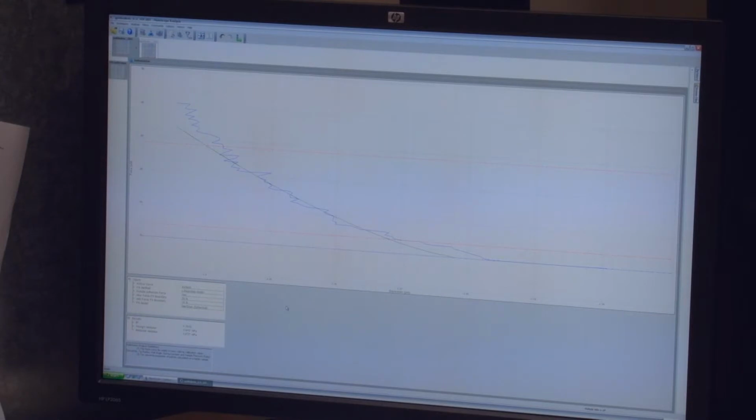So what I have here is that approaching force curve shown in blue on this plot. And I'm going to fit it with a model that takes into account the shape of our tip. Our tip is a conically shaped tip, and so we'll use the Sneddon model in order to calculate the Young's modulus for this particular series of indentations.